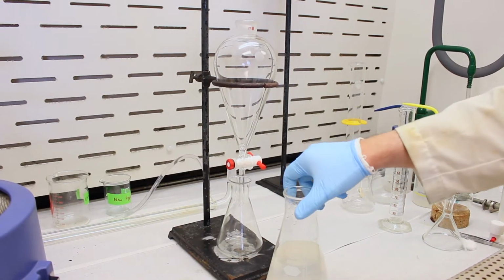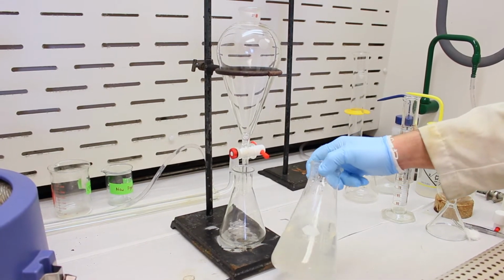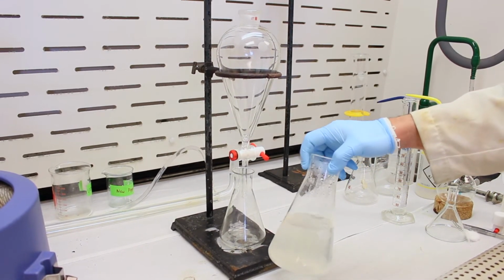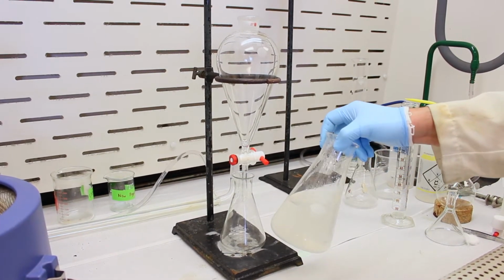Alright, so we've got our distillate from the steam distillation, and as you can see, it's fairly milky because it has both eugenol and water in it. So now we're going to commence with the liquid extraction portion of it.